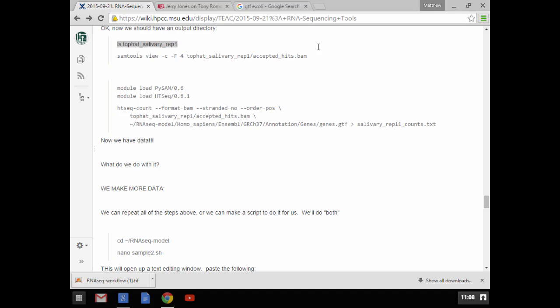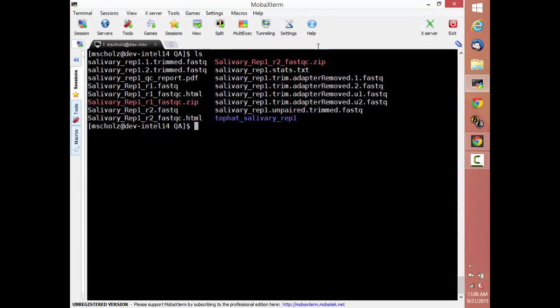So you'll be a little behind me, which is fine. Yeah, well, we're probably all doing it at the same time, and it's doing work in a funny way, so that's fine. It may, in fact, not work out for everyone. It should, but well, we're not going to worry about it.